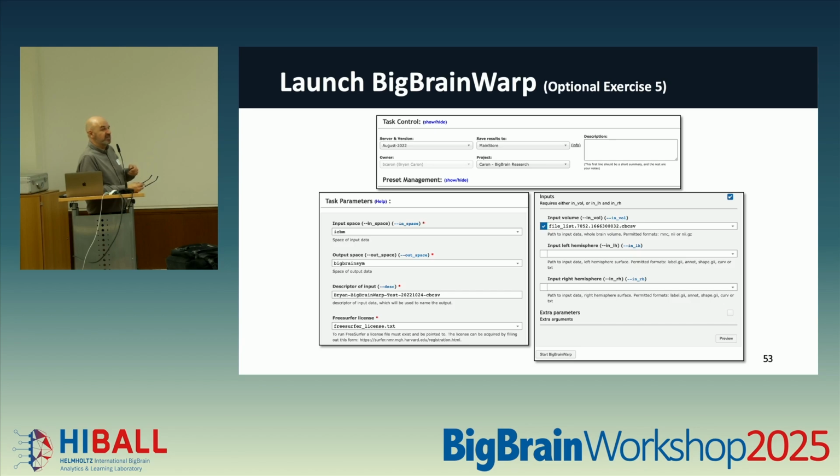So now you're going to get to the exact same menu of options where you're doing your task control, right? You want to tell it to store it in main store, right? That's just the physical server that we have. But then you can specify, again, the project that you created at the very beginning, the very first exercise. And you're going to do the exact same thing, but remember, set input space as ICBM, output space as the BigBrain sim.